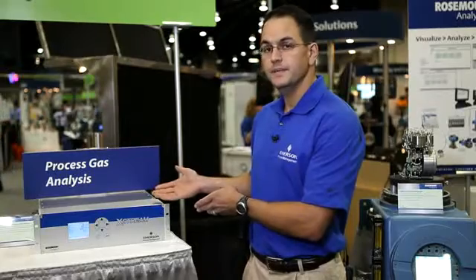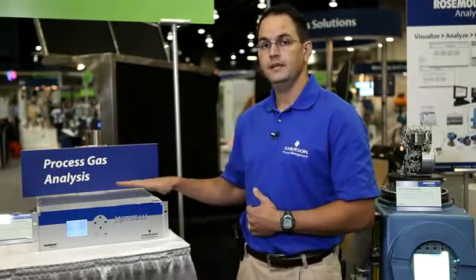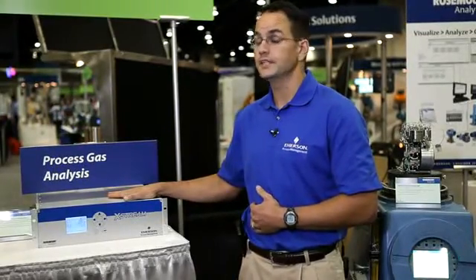The Xtreme XE does not have any proprietary software associated with it. You can simply go to your web browser, type in the IP address of the Xtreme XE, and remotely maintain, diagnose, and gather data from your Xtreme XE process gas analyzer. It's really that simple.